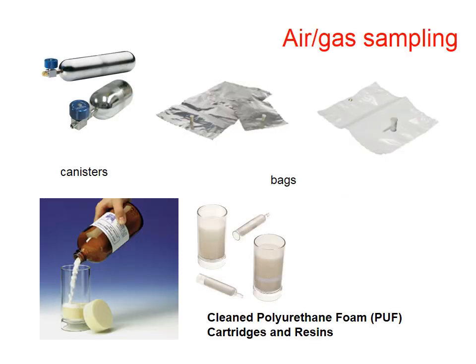We'll start with, of course, the easiest way, when you have the sample in gas. You can collect it in a bag, you can collect it in canister.